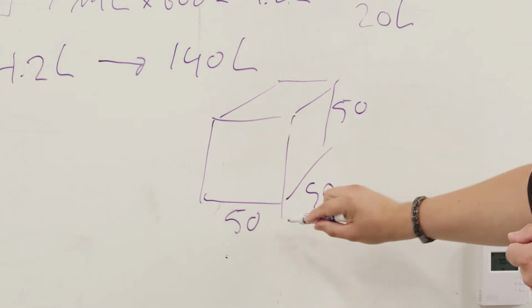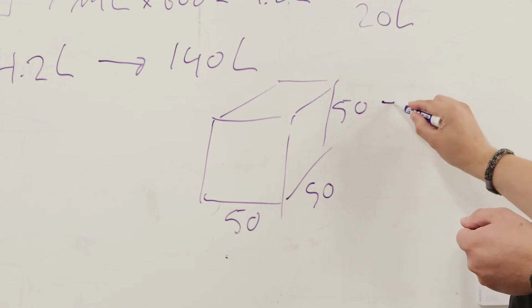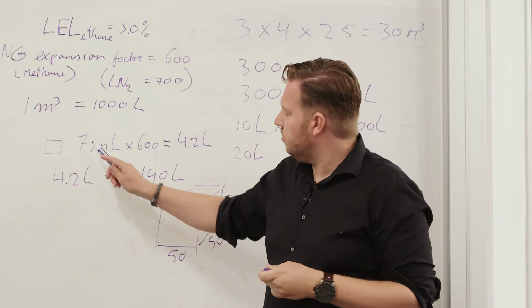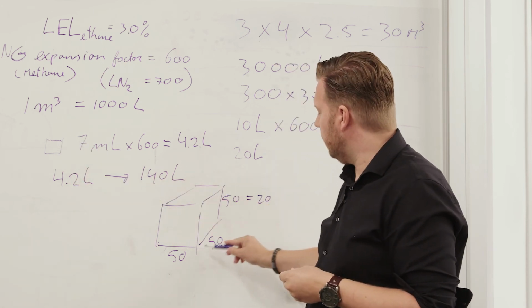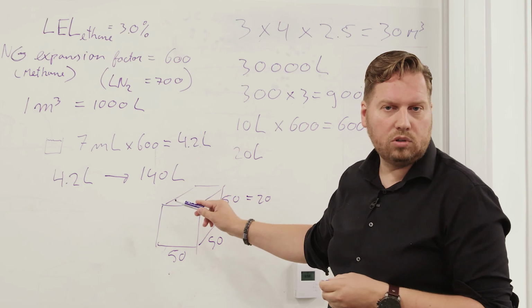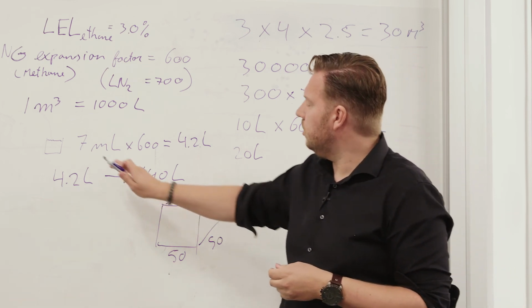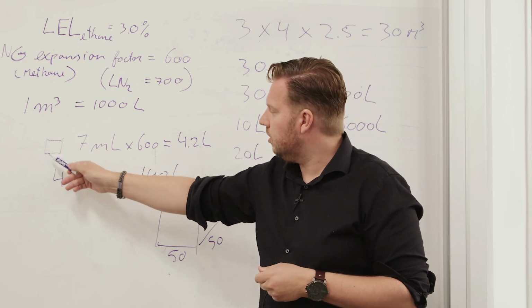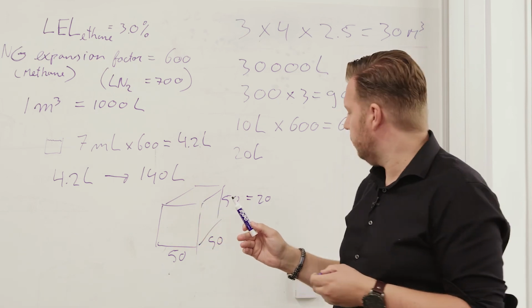So half a meter by half a meter by half a meter, or if we do it in inches, this is about 20 inches. So basically this amount of liquid ethane will always be in a space that is larger than a box of 50 by 50 by 50 centimeters, and therefore there is no hazard of any explosion when dealing daily with the amount of liquid ethane that we're actually working with.